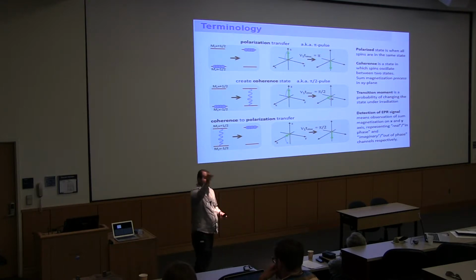Remember, we're talking about the rotating frame, and we're focusing on the rotation with the Larmor precession, right? So what if we are not like this? What if we are like this, and we're turning? So that will be in phase, this will be out of phase, all right?